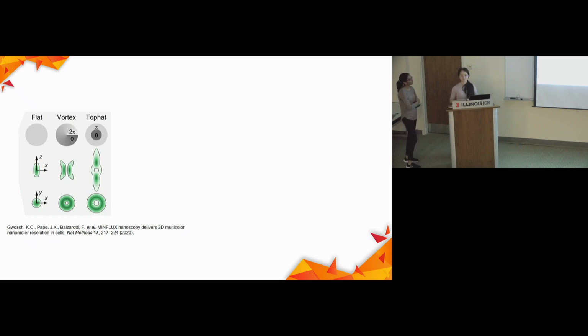Cool. Thank you. And then the second one is, so there are bright fields in the. Yeah, there are bright fields. So before, what we are testing with our live cell sample is we co-microinject two dyes, not only the dye for MINFLUX tracking that's red, we also co-microinject the green dye just to see the cell shape on the eyepiece. Otherwise, you don't know which cell has the molecule, which cell does not have the red molecule. Because the red molecule is very, very dim.